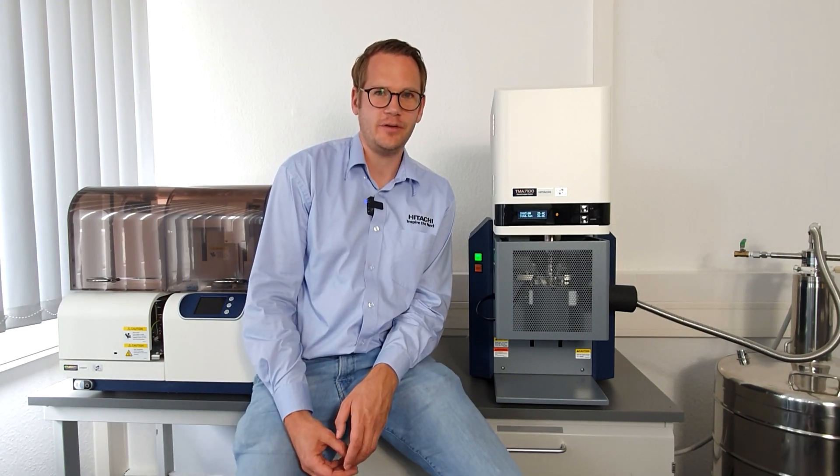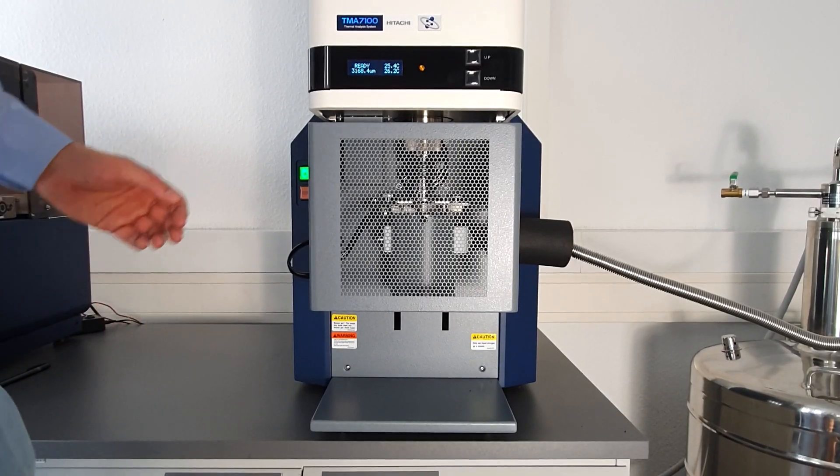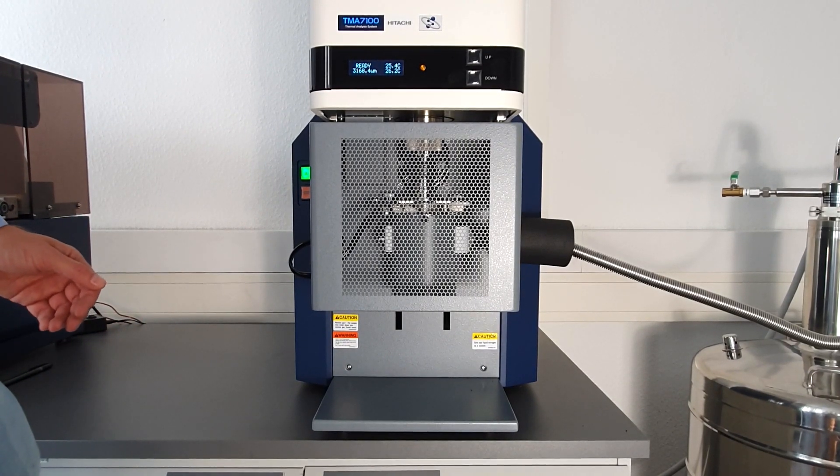The high level of accuracy, the good signal-to-noise ratio, and the wide range of load enables you to measure a wide variety of samples. The robust design of our TMA consists of a few main parts.